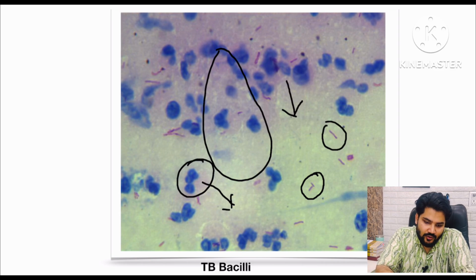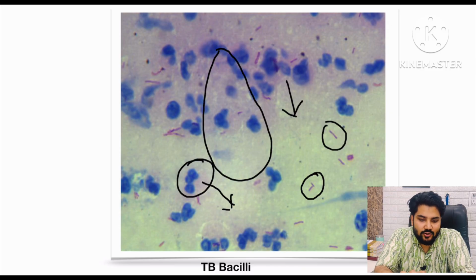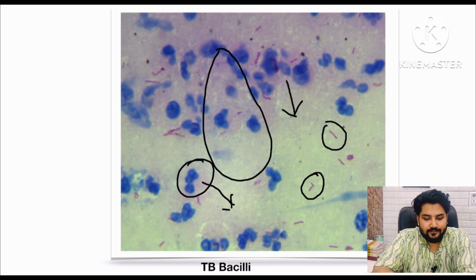Look at these, these are your red bacilli, and this blue is the background, just remember that. And these structures are your neutrophils. Okay, so this is a picture of sputum.